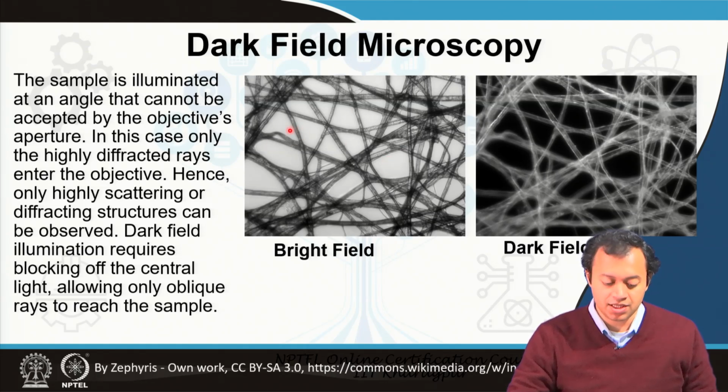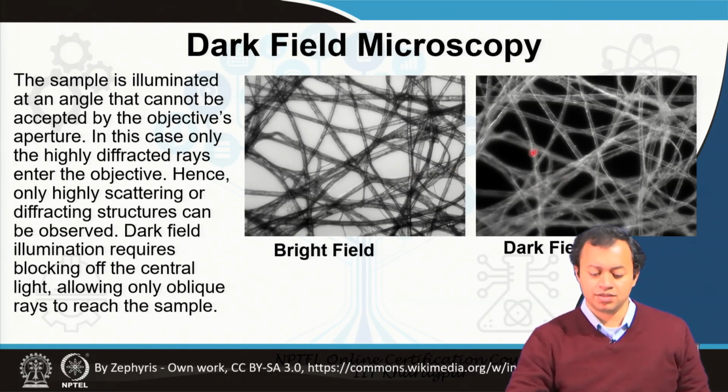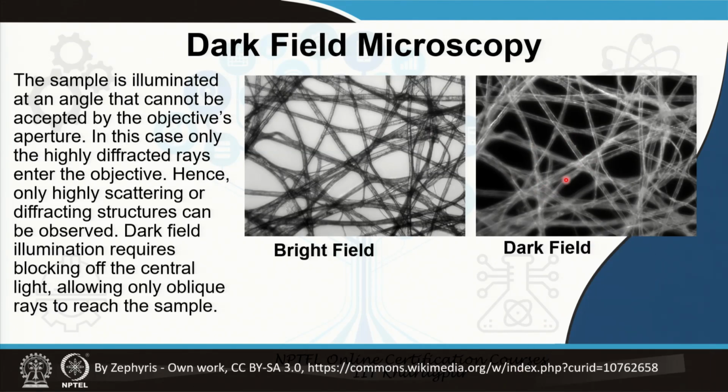Light coming from this diffracts and forms an oblique angle to reach the detector, right. So, if you have highly scattering material, these are not, but still they can be utilized. For highly scattering material, you use dark field microscopy, and it sometimes helps.